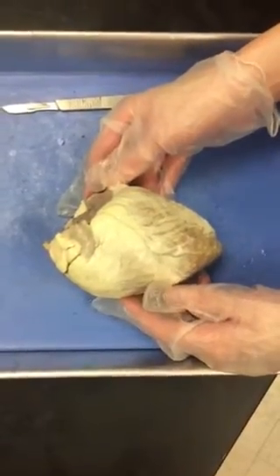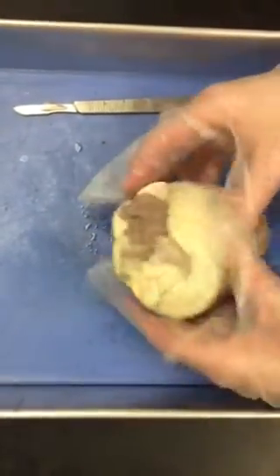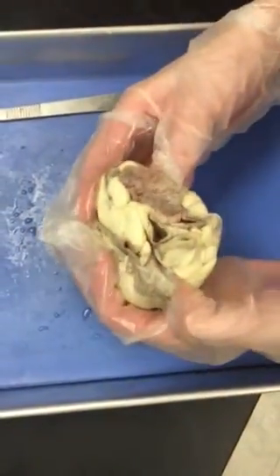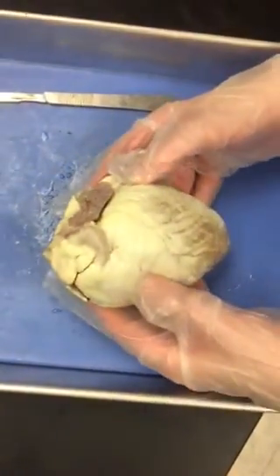15, note that above the ventricles is an area called the base of the heart. At each side, left and right, there are ear-like extensions of the atria called auricles. Under each auricle are the left atrium and the right atrium. Number 16, in the space below, explain the functions of the left and right atria.